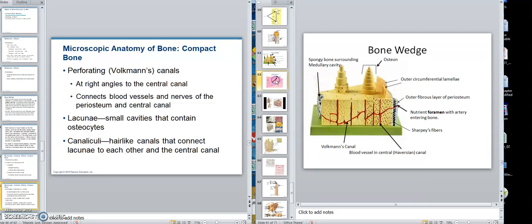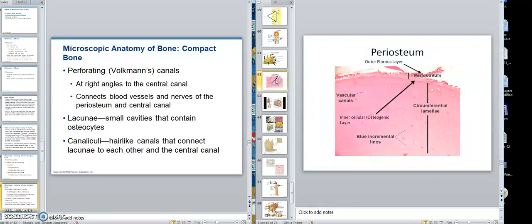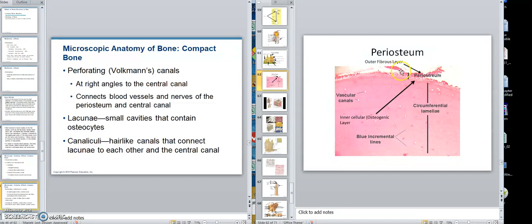This picture here would show that. This would be a thin slice, shaved, called a ground bone section — we grind it down. Looking at it this way, this is the periosteum on a slide. This is the outer fibrous layer of the periosteum, and in here would have been the inner osteogenic, the inner cellular layer.